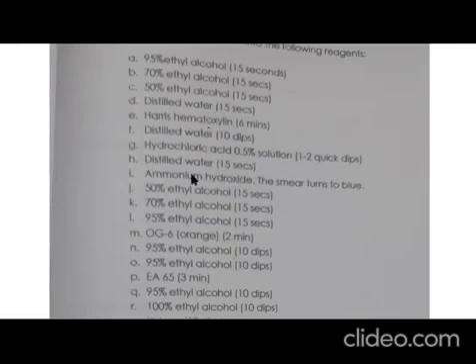And as a consequence of that, the color now of your hematoxylin stained cells, it will become, from red, it will become blue. Okay? So, specifically, anong part ng cell ang magre-red to blue? It's the nucleus. Kasi diba, hematoxylin, no? Yung ating subject to alkaline condition here. And again, it is a nuclear stain, no?